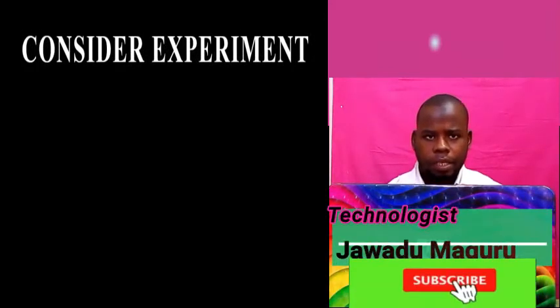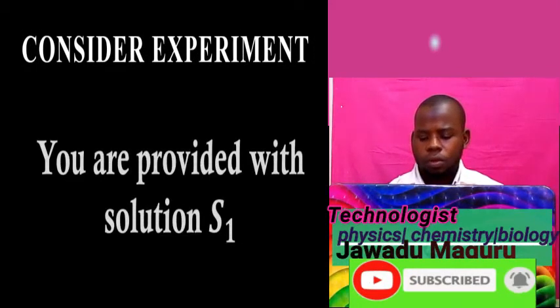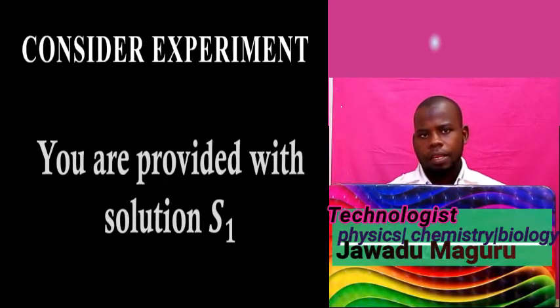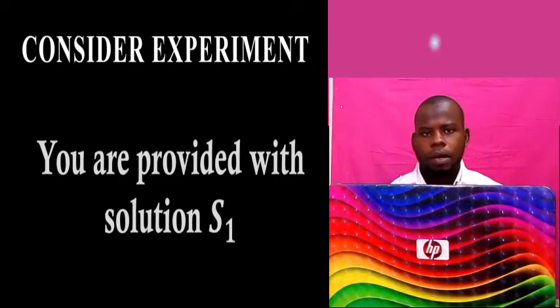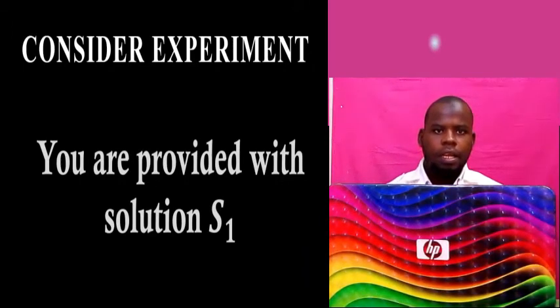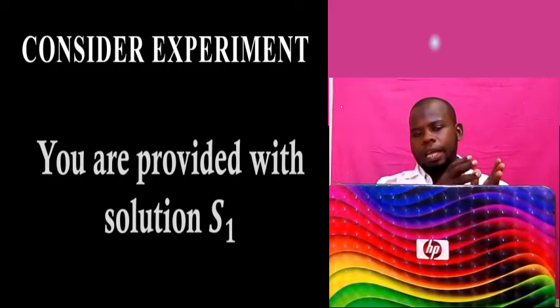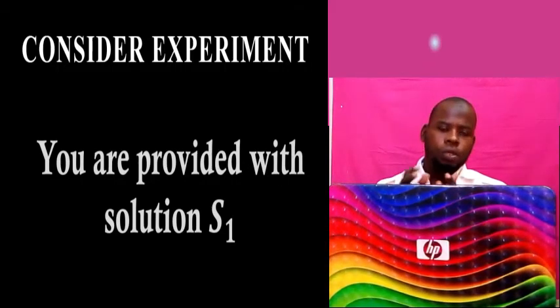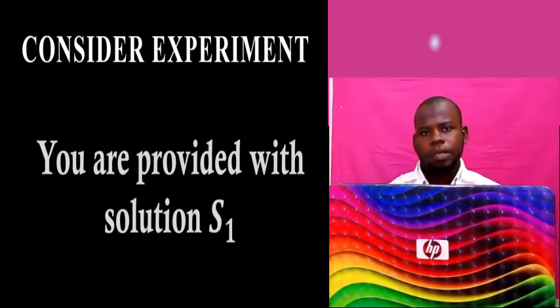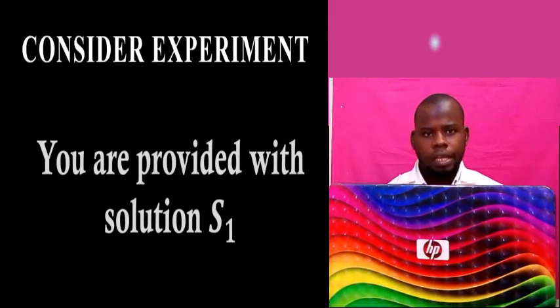Consider the experiment. In the experiment you are provided with a solution, as you can have a sample in a nutrition question. Let's say sample X, sample S1. There is a mixture of different foods. You can take egg yolk, you dissolve sucrose, glucose, you can mix with the lipids. So that, you can call it solution S1.